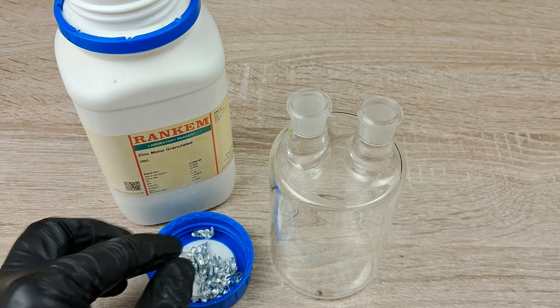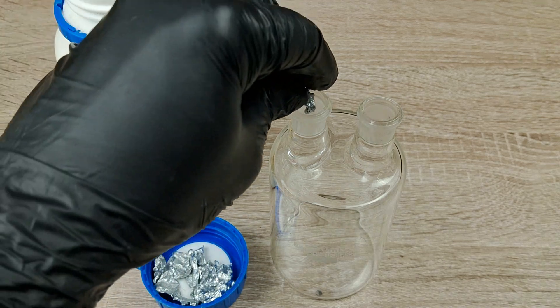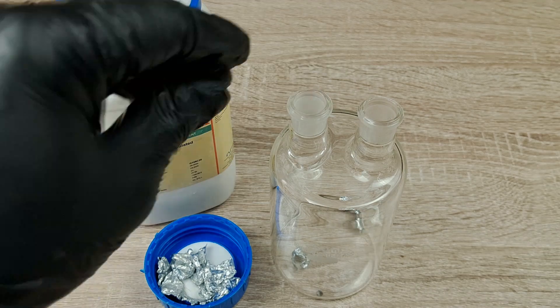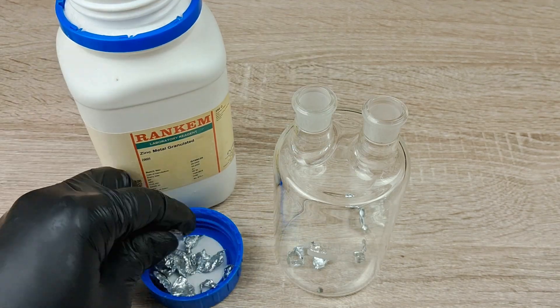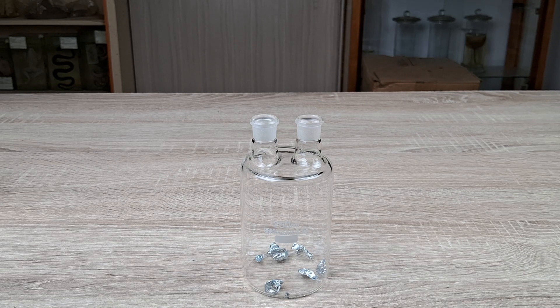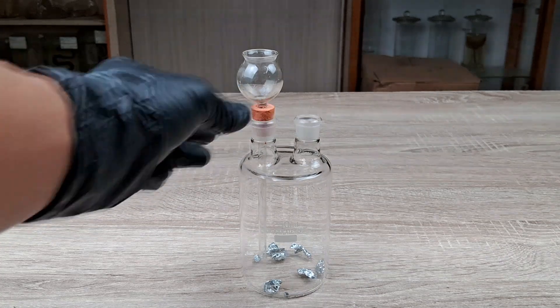To begin the experiment, first introduce a few pieces of zinc granules into the Wolf bottle or whichever type of bottle you're using. Next, stopper the two holes of the bottle with the rubber corks pre-inserted with the thistle funnel and the delivery tube.